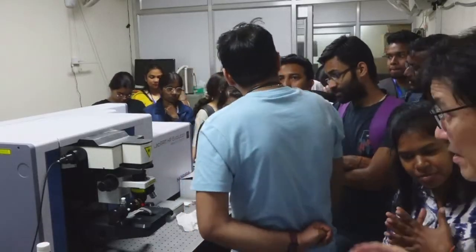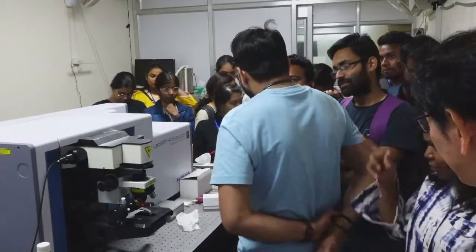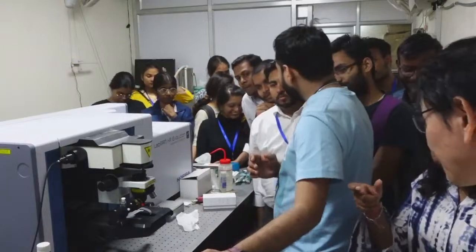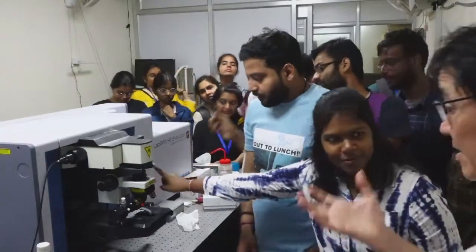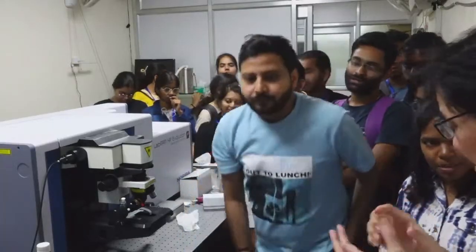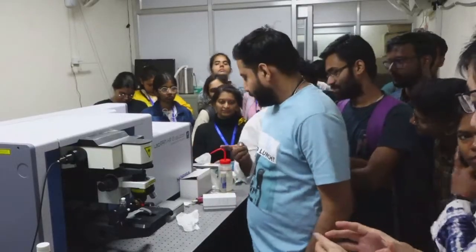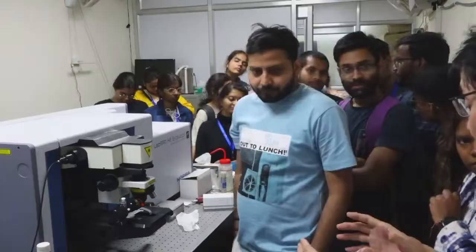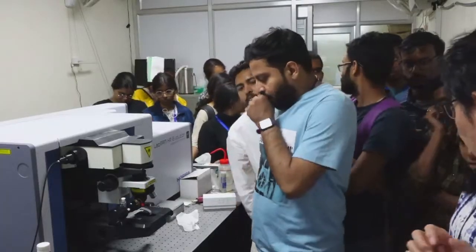There is a button to show the visible image. What is the function of this? By changing X, Y, Z and focal length, focus the sample. Initially the image is very broad, and it becomes clear at one point.